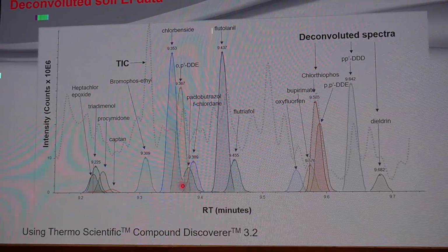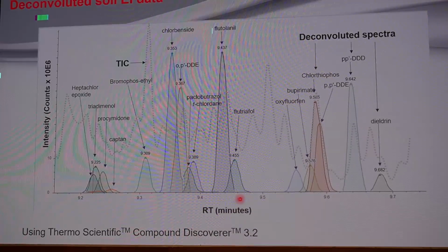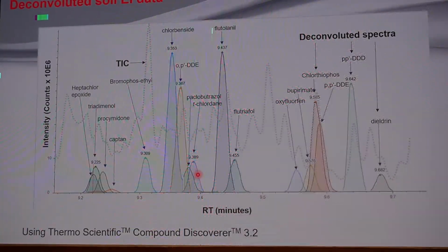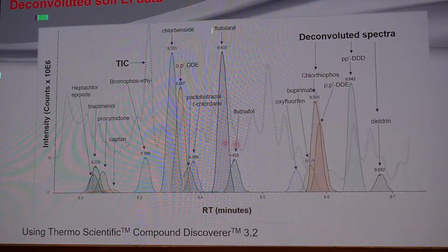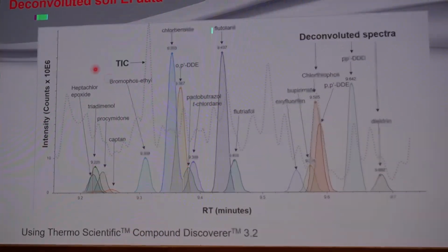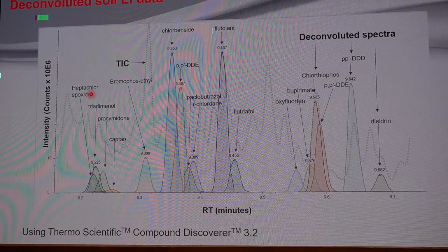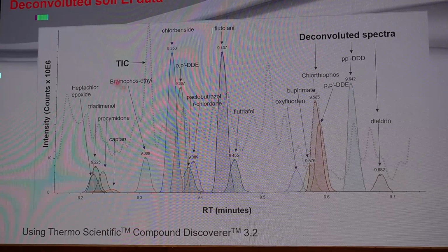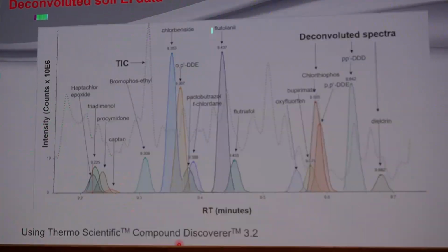So it automatically simplifies things, and you can easily recognize your exact mass with respect to the retention time, as well as get the calculated area. Then the software will automatically recognize which compound is related to which name, either the common name or maybe the IUPAC name. That nomenclature is also given by the software, Compound Discoverer, or you can also get this in TraceFinder.